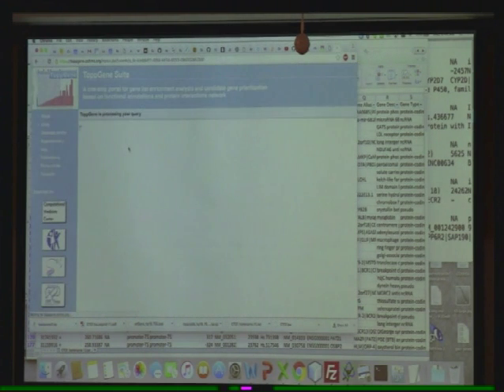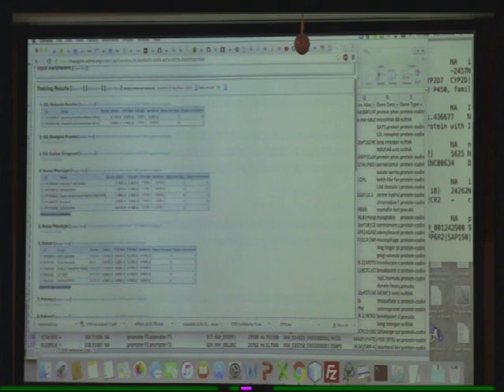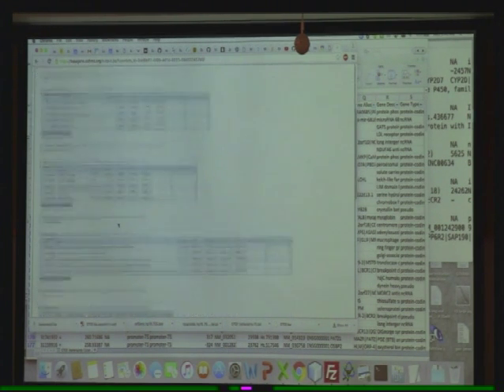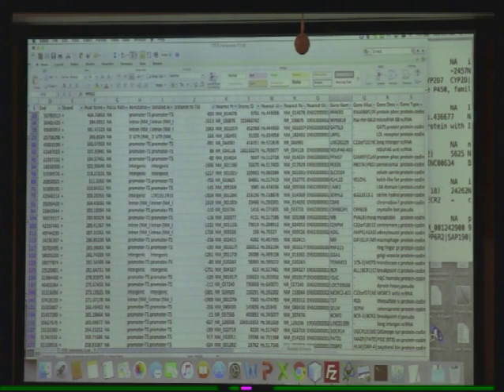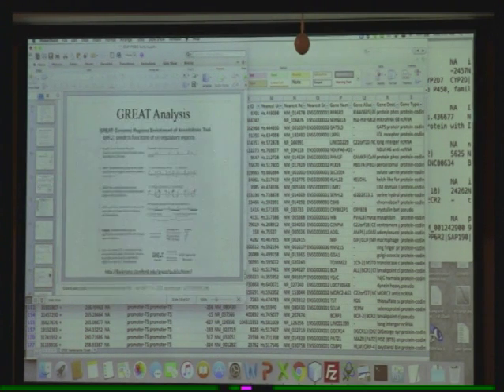You just pasted the top data? Yeah, just the ones that were within 2 kb of the transcriptional start site. You can maybe see CTCF has to do with schizophrenia. Actually, schizophrenia comes up a lot. And then you could look at what genes were called under that. Okay, let's go back. And here was the output.